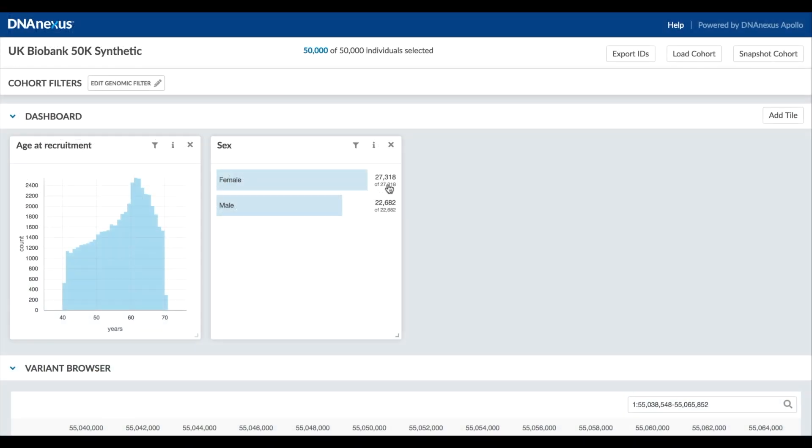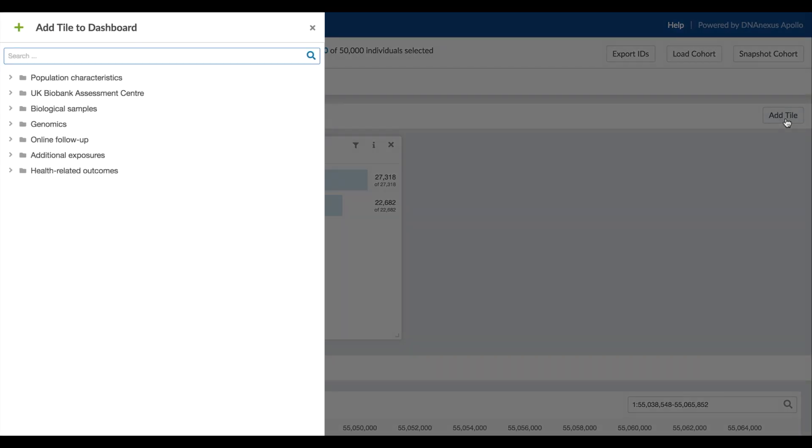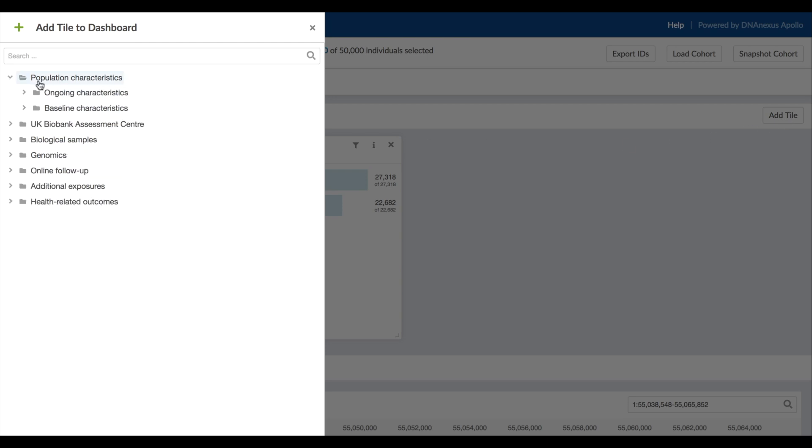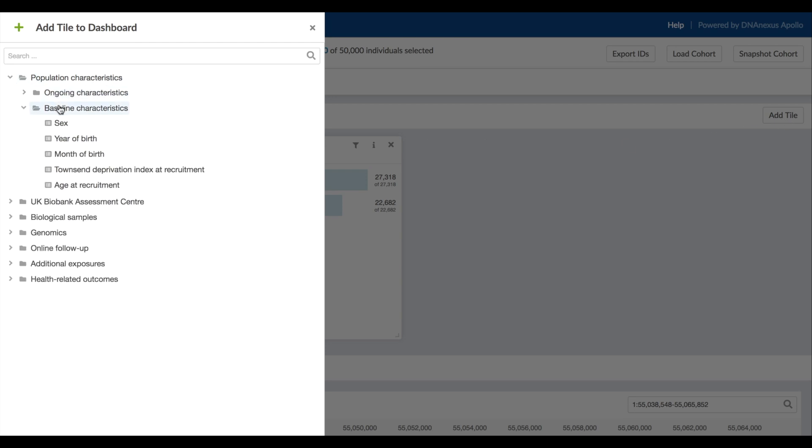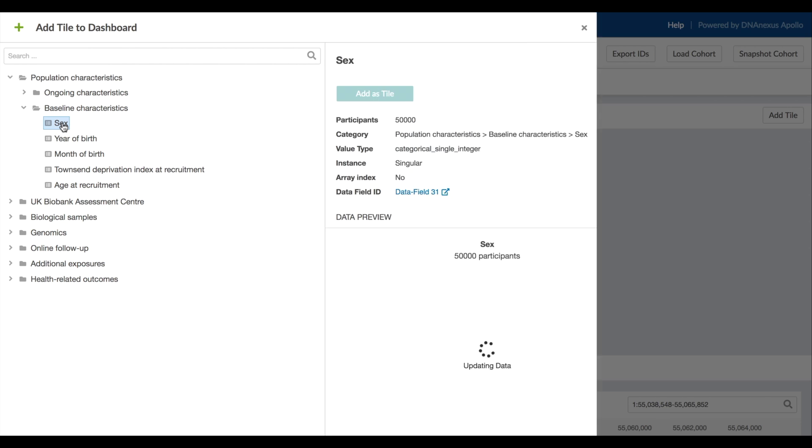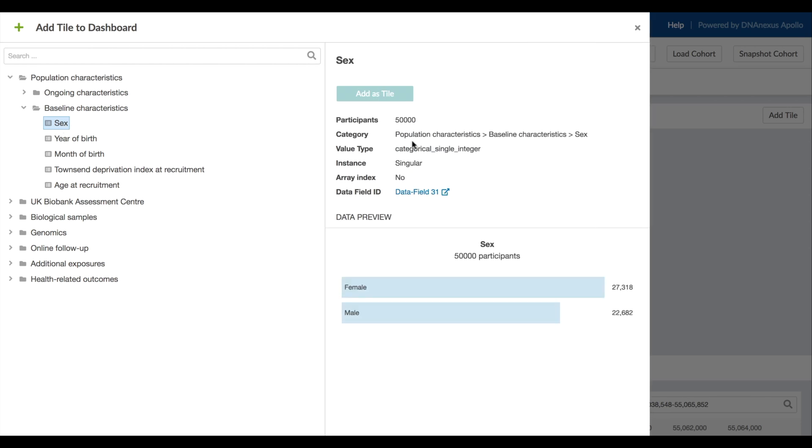We start with a visual dashboard where each phenotype is a separate tile. We're going to customize it by adding more phenotypes. All of the available phenotypes have been organized in a hierarchy for browsing. For example, the participant sex is listed under baseline characteristics.